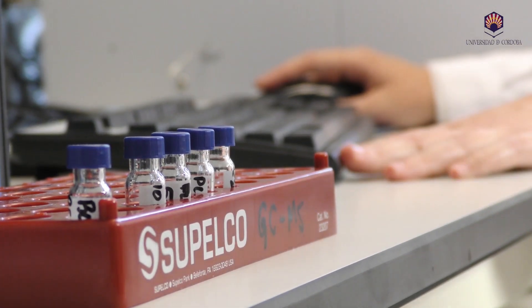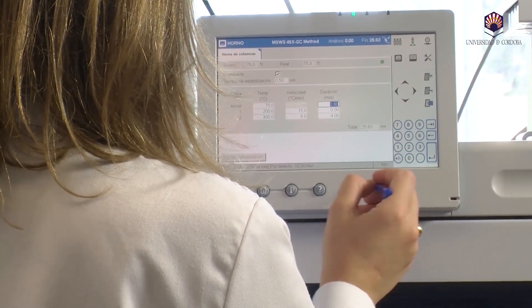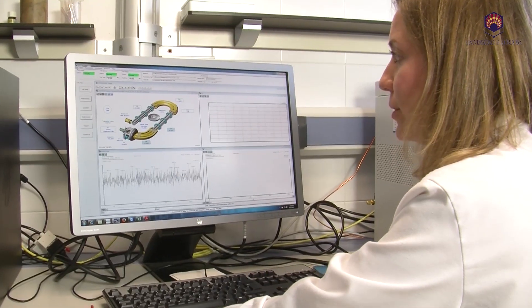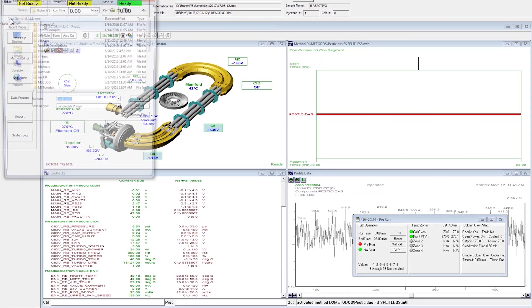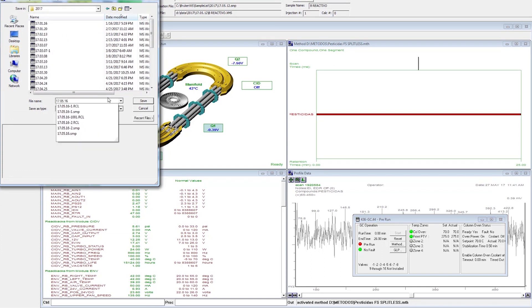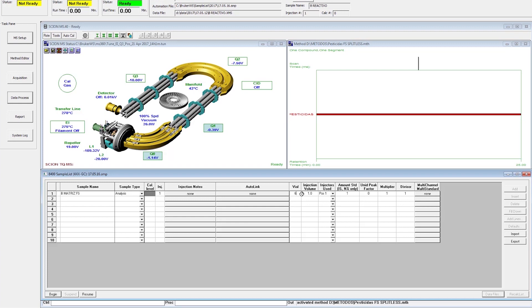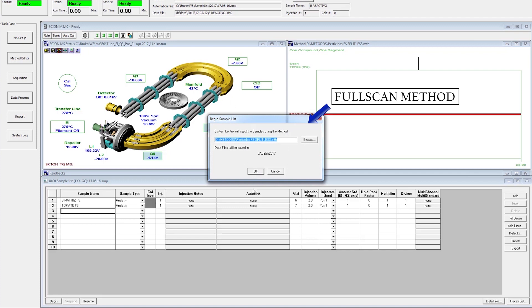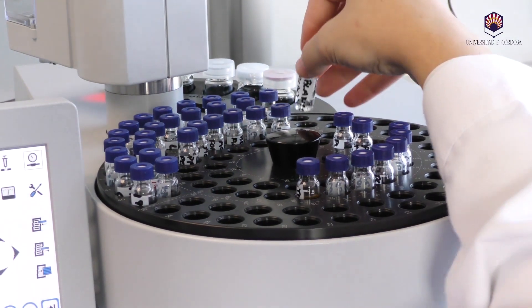After preparing the samples and prior to injection, we verify the instrumental parameters of both the gas chromatograph and the mass spectrometer, ensuring they are both ready. To proceed with the analysis of the samples, the sequence is first created in its corresponding folder. First, we inject the matrix blank, specifying both the position of the vial and the volume of injection. Secondly, we insert the prepared tomato sample, select the folder where the data will be saved, and the full scan method of analysis for the qualitative analysis.